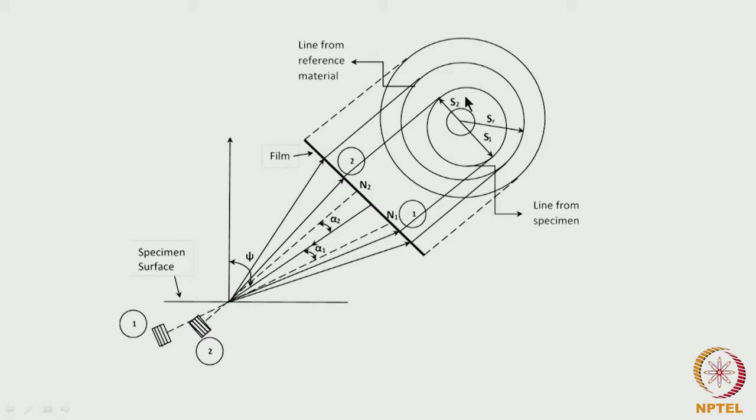The reason is this: when we do this incidence angle pinhole photography, then for example, we have got two series of atomic planes. Now, this is one series and this is another series. What happens is the strain in the direction normal to the atomic planes will vary with the angle from the normal direction.